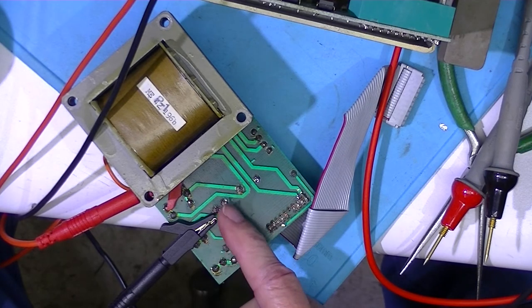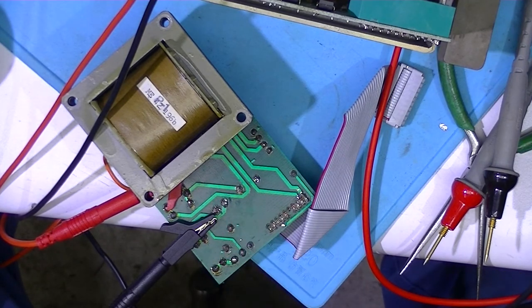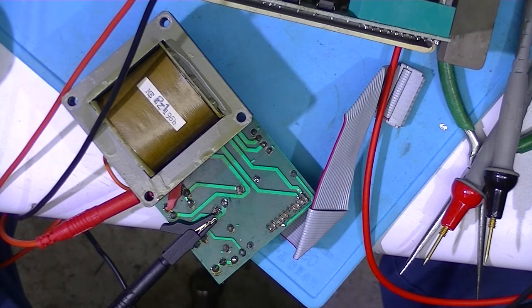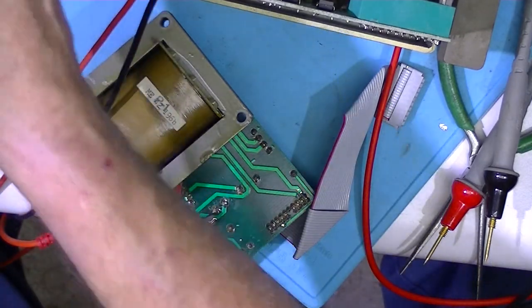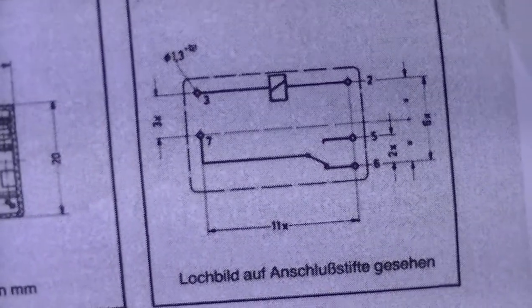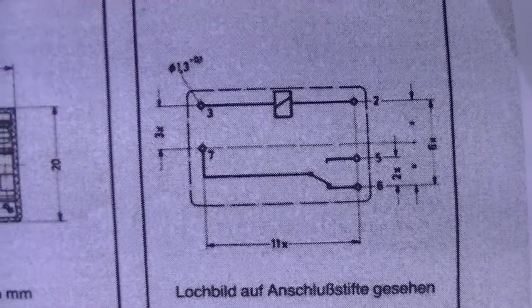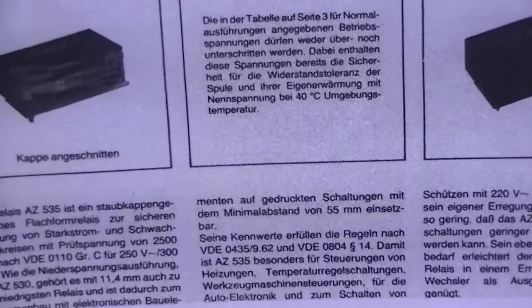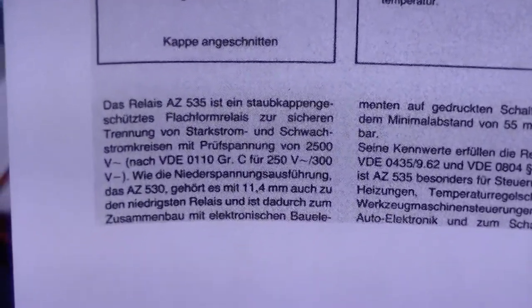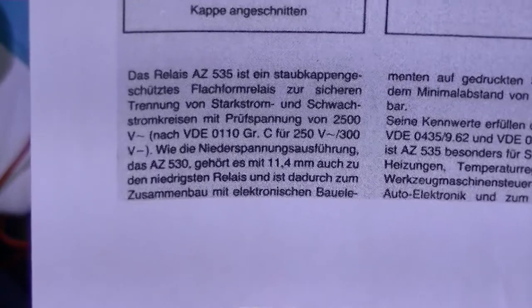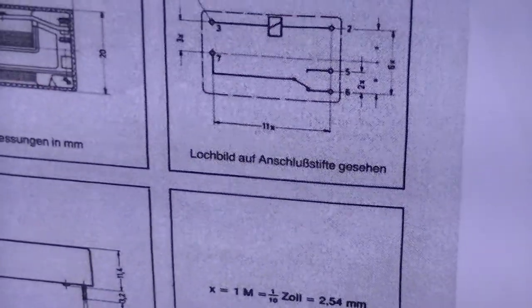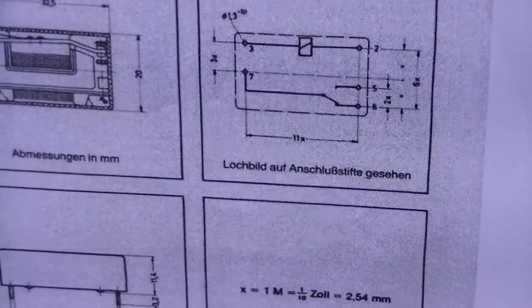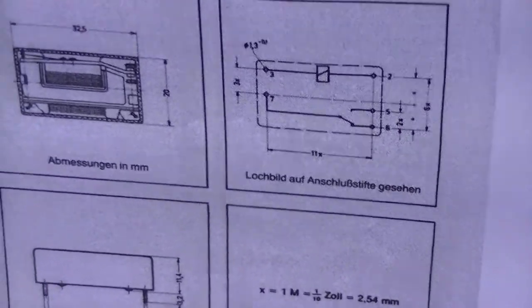I've soldered two of the switch terminals, I've soldered short pieces of wire to them. I found this, the text is in Polish maybe, in any event I've soldered at the terminals six and seven.